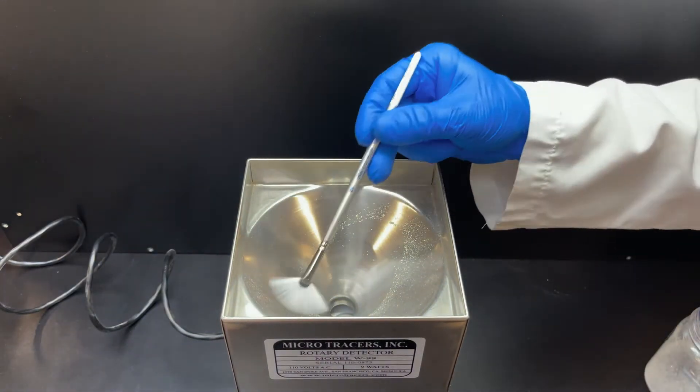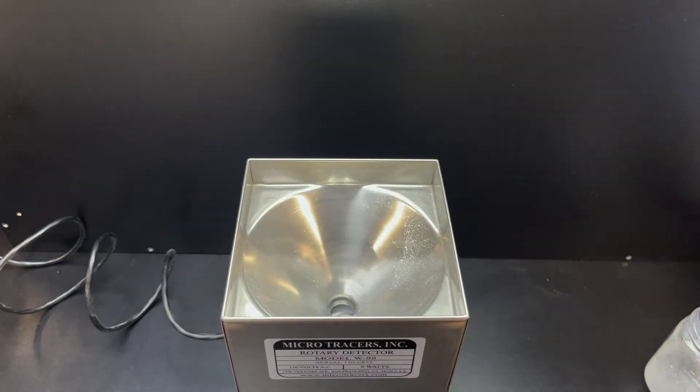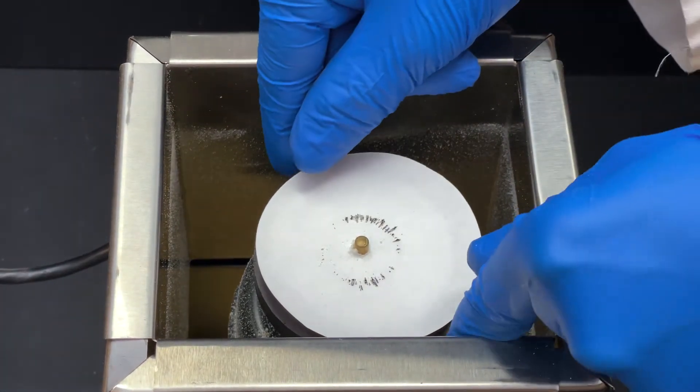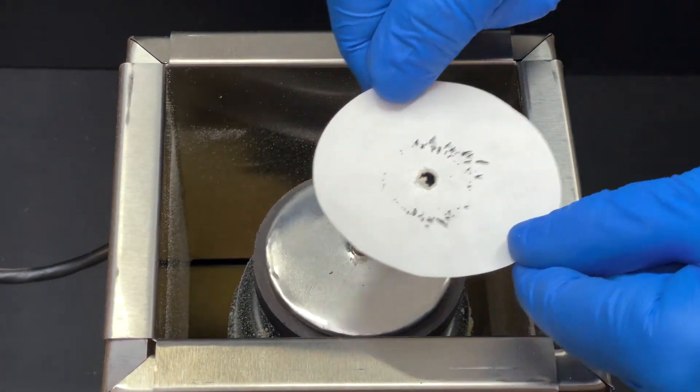After the sample has completely passed the rotating magnet, turn off the rotary detector and remove the upper hopper. After the magnet stops spinning, carefully remove the filter paper.